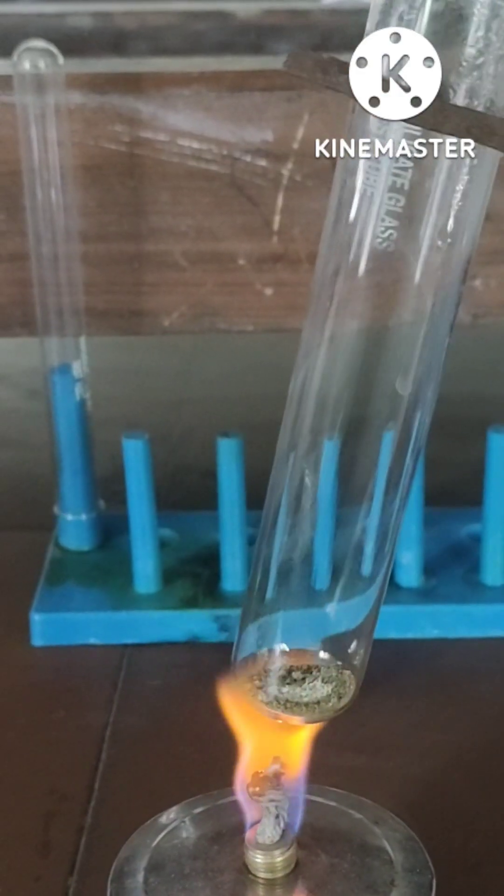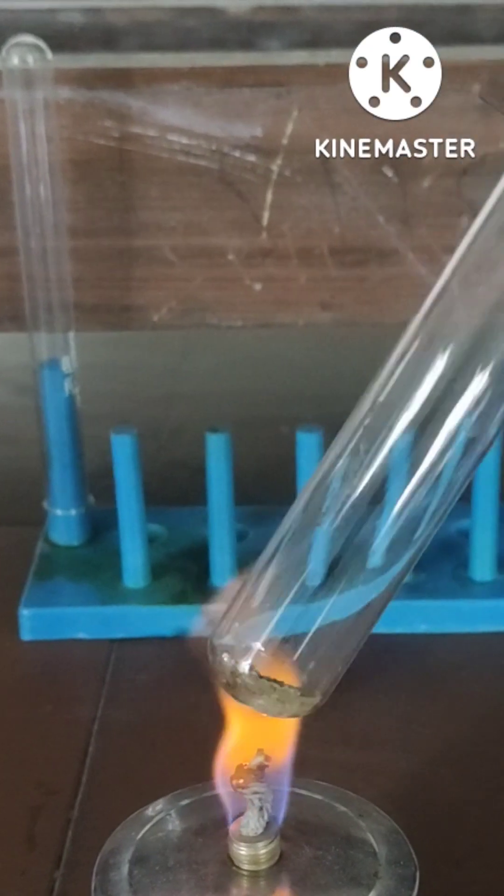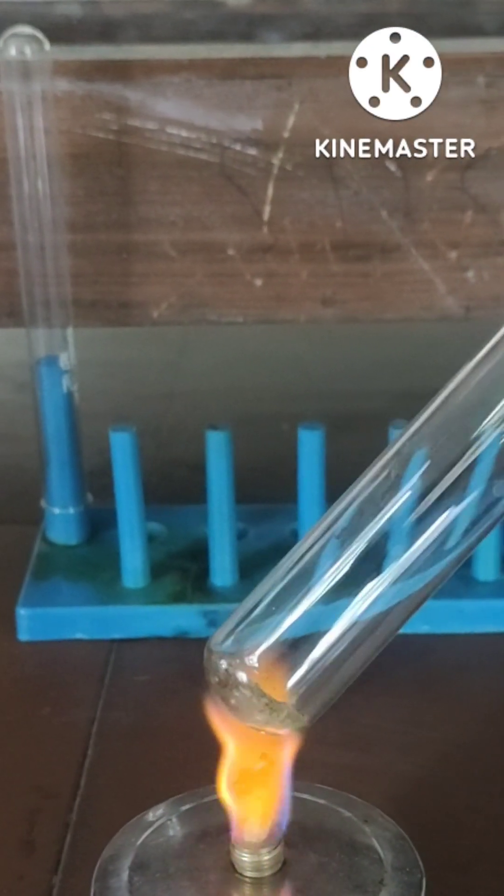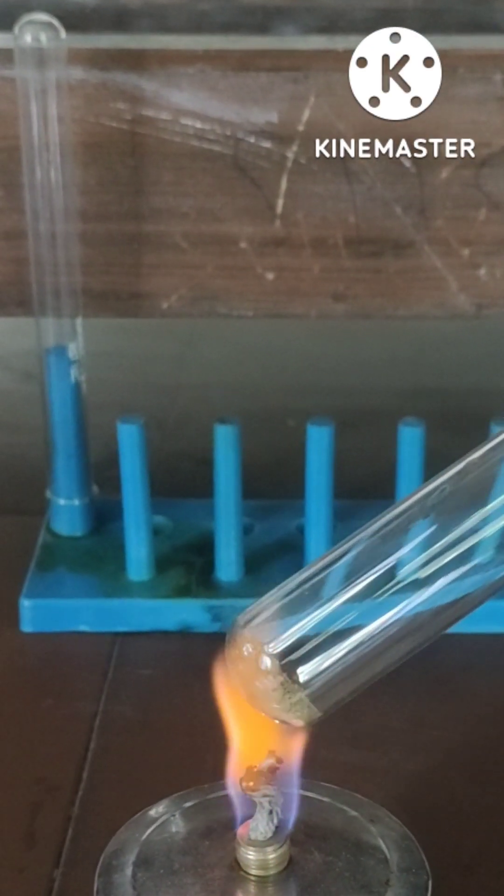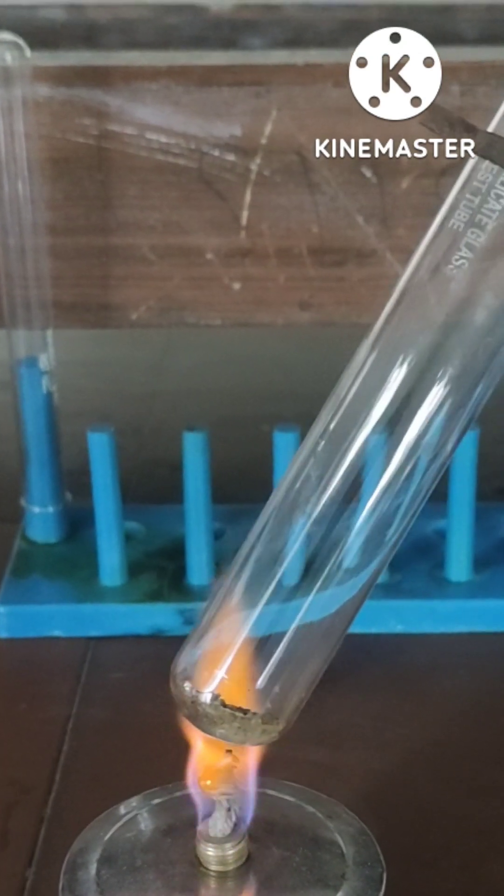After heating, the color changes from green to white, and from white it changes to dark brown.